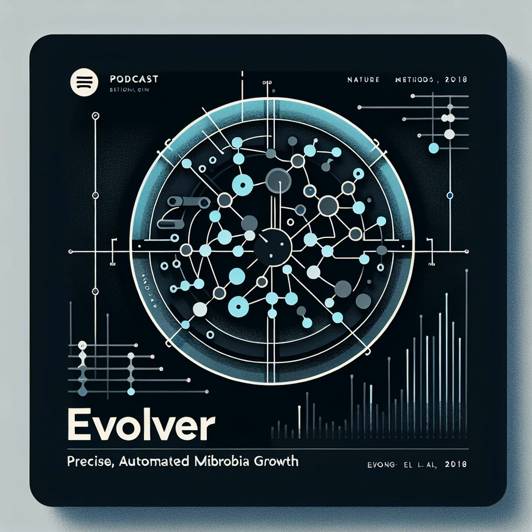Let's start with the smart sleeves. What's the clever design aspect there? Each smart sleeve is essentially a mini-lab for a single culture. It houses the culture vial, along with integrated sensors and actuators for controlling things like temperature, stirring, and optical density. The beauty of this is it gives individual control over each culture.